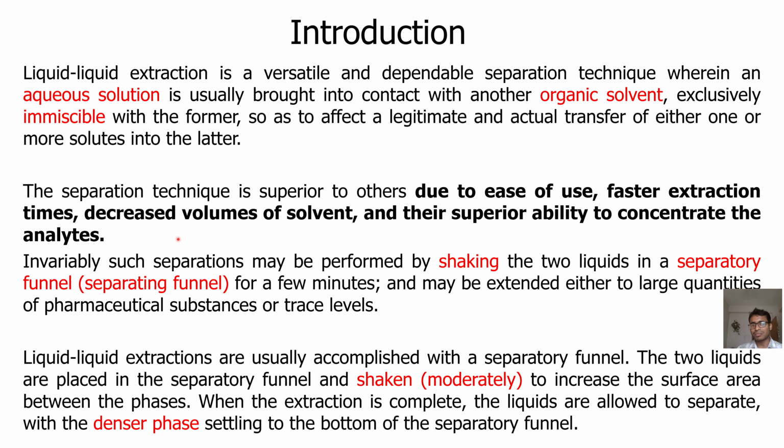So in liquid-liquid extraction, what we usually perform is this: whenever we are extracting contents from roots or leaves of some medicinal plants, then utilizing this extract we usually perform liquid-liquid extraction, because this extract has some polar compounds, some non-polar compounds, some intermediate polar compounds. Then obviously you need to isolate the compounds based on their polarity. That is why liquid-liquid extraction is usually performed.